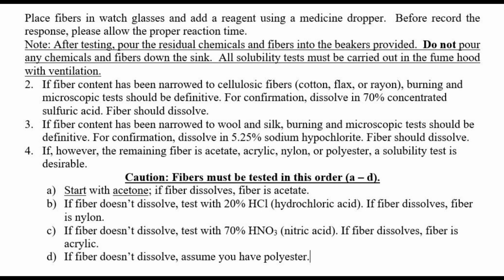So for the synthetic fibers, we must follow this testing order. Like here you can see in the instruction sheet: acetone, hydrochloric acid and then nitric acid. If the fiber dissolves in acetone, we can conclude it is acetate fiber.